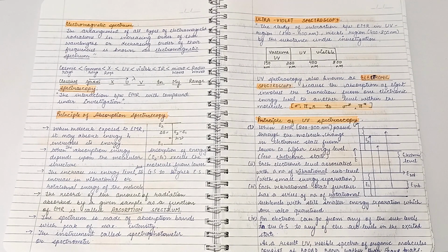So what is the principle of UV spectroscopy? When electromagnetic radiation in the range of 200 to 800 nanometer is passed through a molecule, the change in electronic state from lower to higher energy level takes place.